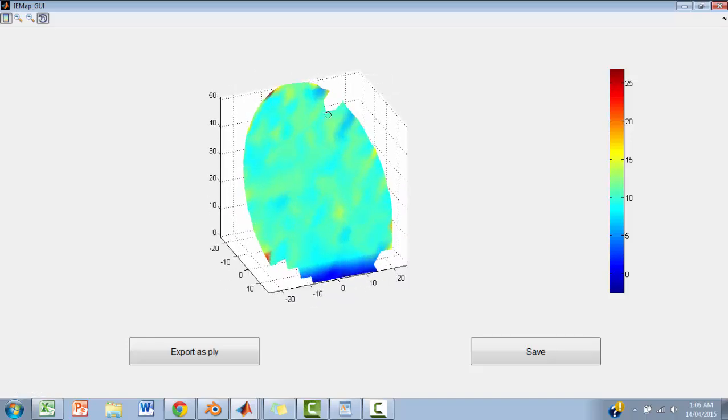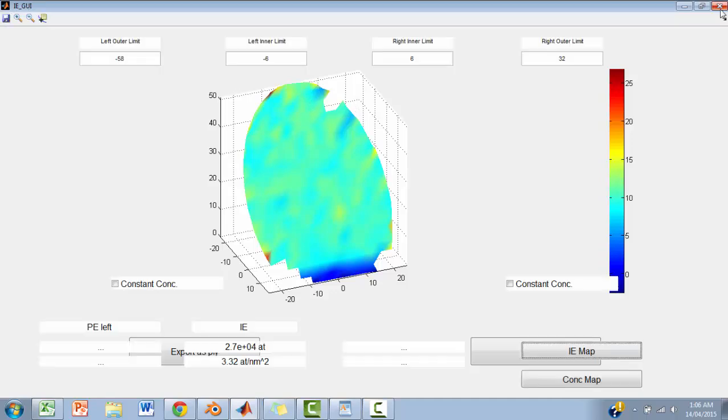In this, it's not very interesting because the data was made up, this was random. You can see the corners here and up here are chopped off. It's because the mesh was too close to the edge and there wasn't any background region for it to calculate, so it just doesn't show the vertex.